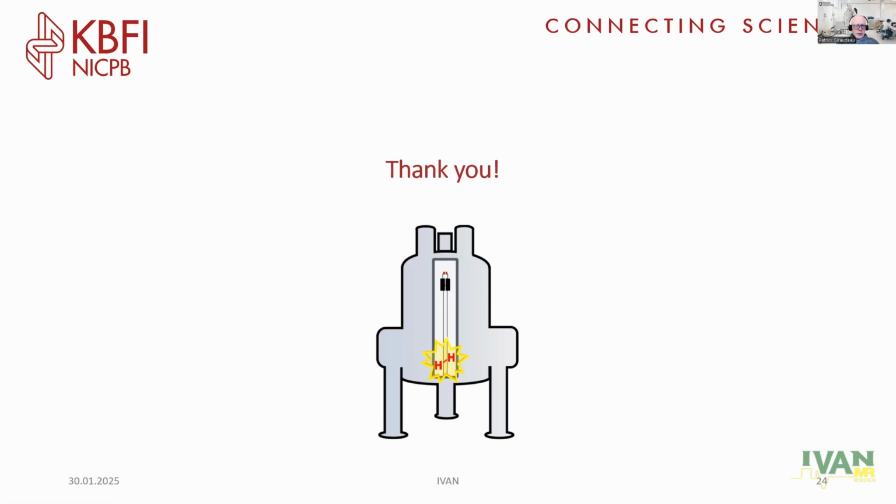Well, very impressive results, including new results that I had not seen before. When you consider doing metabolomic studies, one of the sensitive elements is the sensitivity of NMR to pH. Well, this is well known, but I was wondering if you were expecting an effect of pH on the hyperpolarized signals that would be typically the same as in conventional NMR, or maybe less, or maybe worse.